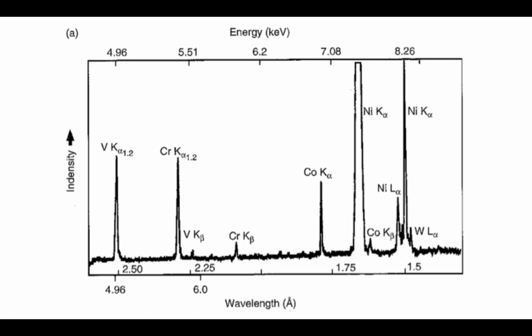Those wavelengths are going to be integer fractions of the wavelength of another. So if we know the first order reflection, then for n equals 2, or n equals 3, we know what those values should be based on the order of reflection. So there's a sequence to those as well. That can be shown.